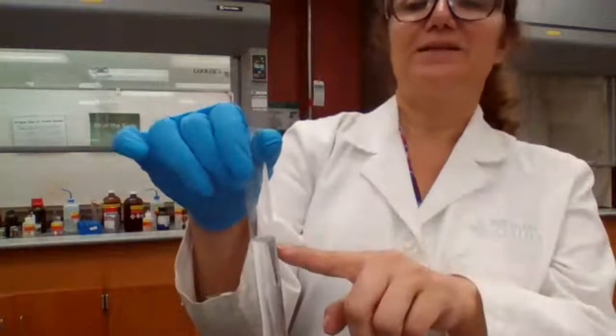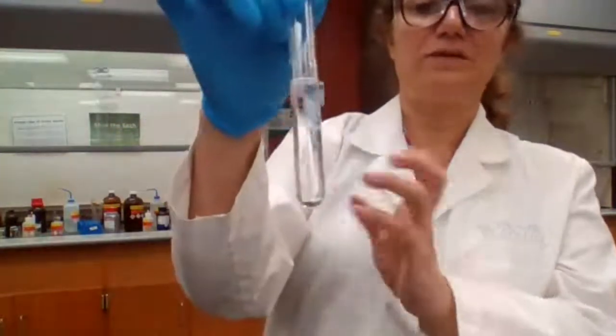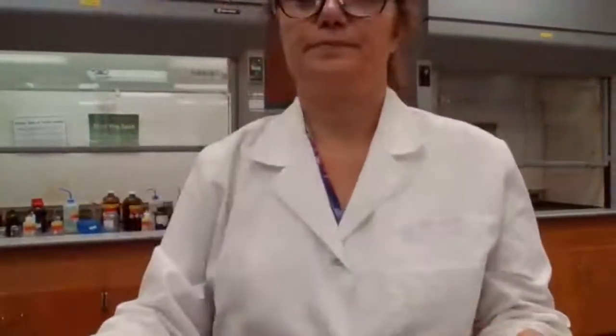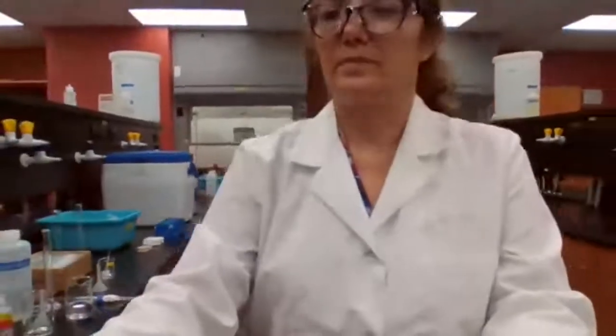So it's benzoic acid in sodium bicarbonate, but eventually it dissolved. Any questions? Any questions for me?